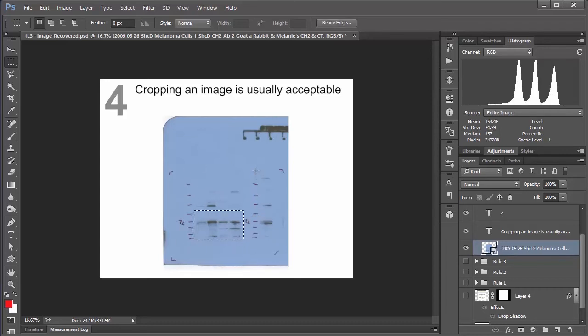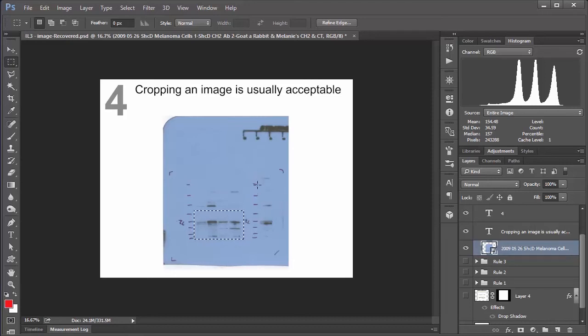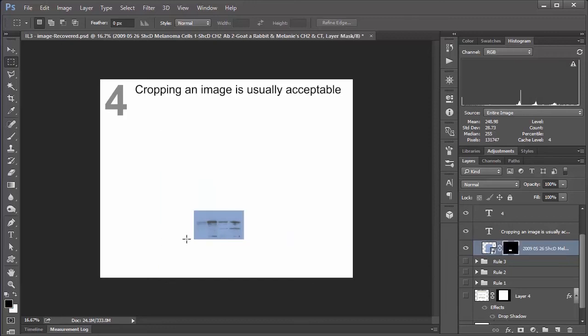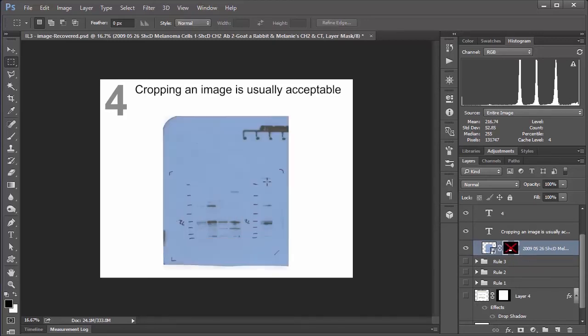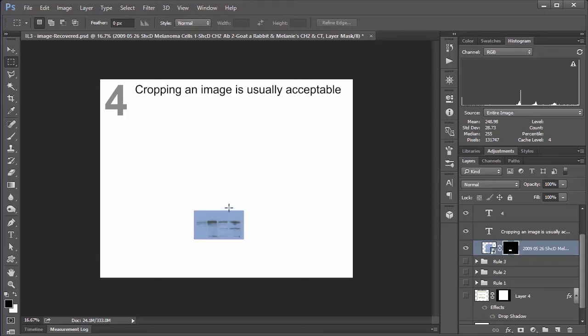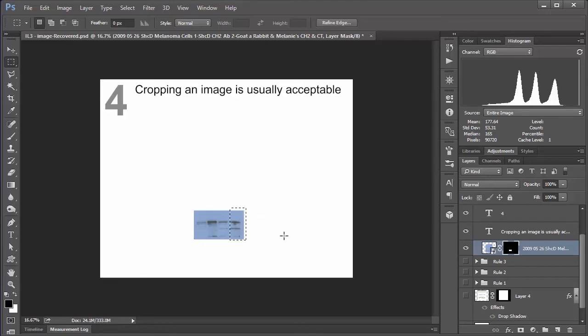So for instance, if I highlight these bands here with the marquee tool and click the mask button, basically does the same function as cropping. But if I ever need to go back and see the rest of my blot here, I can do that at any time. And trust me, that's a very handy thing to be able to do. But in terms of cropping, you just want to use your common sense here. Don't be a dingus and crop out a band because it just doesn't fit with what you're trying to do. Similarly, if you're doing something like cell counting, you don't want to crop out an area of a bunch of dead cells, because that's just lying.